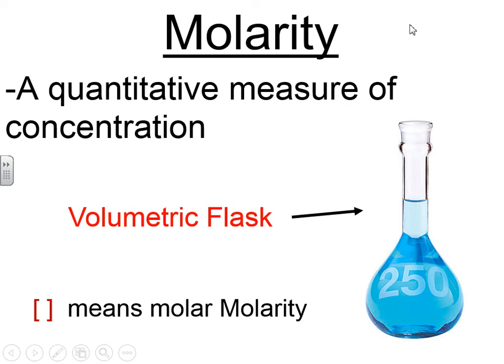Unit 8, Video 4. In this video we will talk about a way of measuring concentration called molarity. This is a quantitative way of measuring how concentrated your solution is. We will actually be using something called a volumetric flask for the task, and we'll do a few labs where we use this special type of flask.